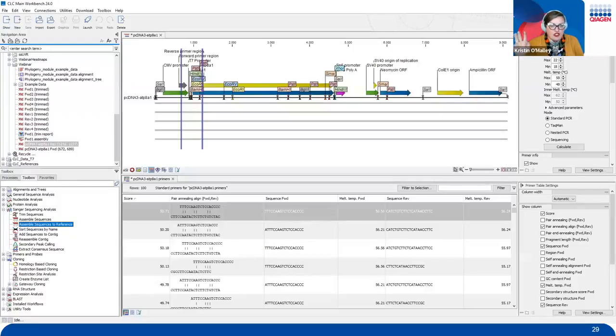So all of your NGS needs will be fulfilled through that Genomics Workbench. Again, all the stuff that we're seeing today is on the main workbench. And if you wanted to upgrade to the Genomics Workbench, all this stuff will also show up in that Genomics Workbench, as well as all the NGS stuff and metagenomic and all of that.